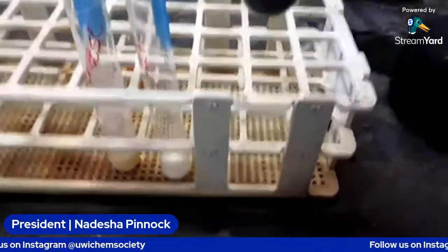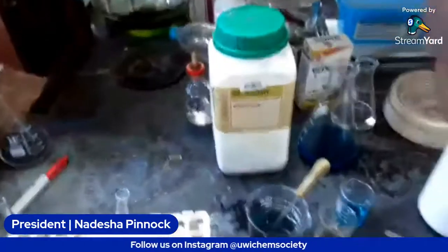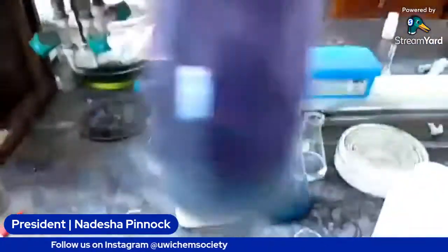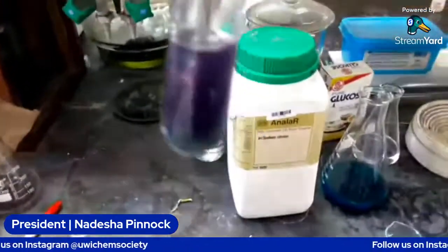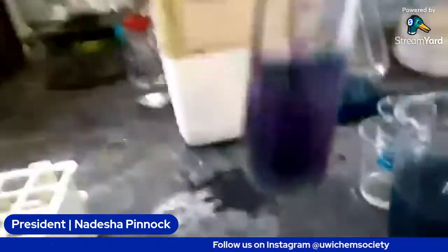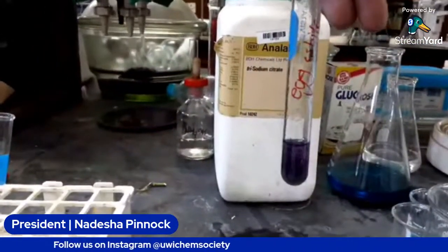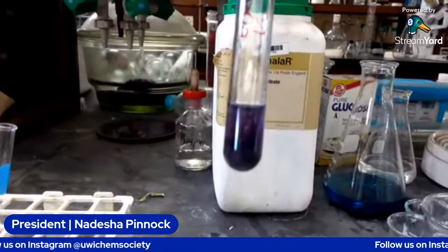And as you can see, it's looking a bit purple. Let me see if you guys can see. So you should be seeing the purple color.